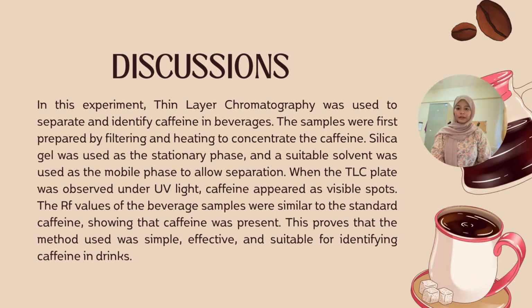When we observed the plate under the UV light, caffeine showed up as visible spots. The RF values from the beverage samples were very close to the standard of caffeine, which confirms that caffeine was present. Overall, this method is reliable, easy to carry out, and works well for identifying caffeine in different drinks.